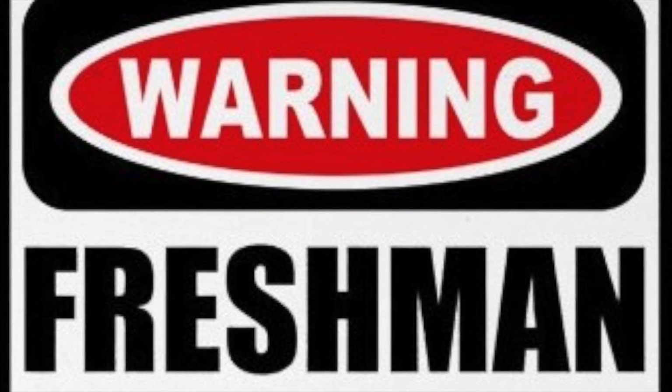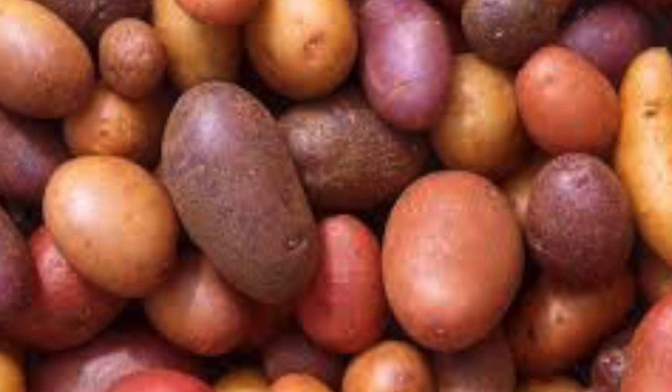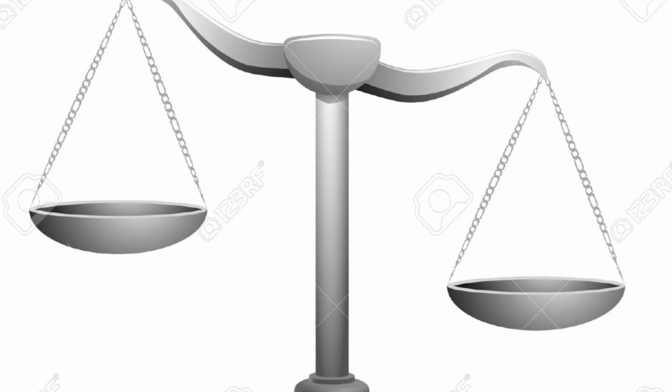Of course, other experimental errors could be possible, such as the freshies messing around with their graduated cylinders, or the potatoes not being perfectly symmetrical. However, the scale change was by far the most noticeable error, therefore being the most prominent source of error in our experiment.